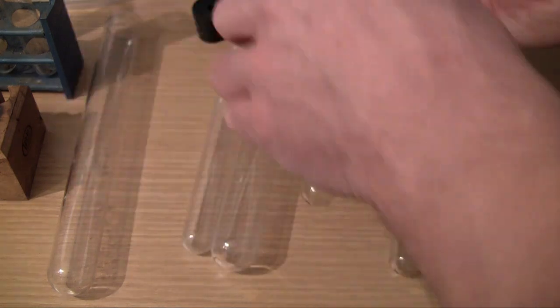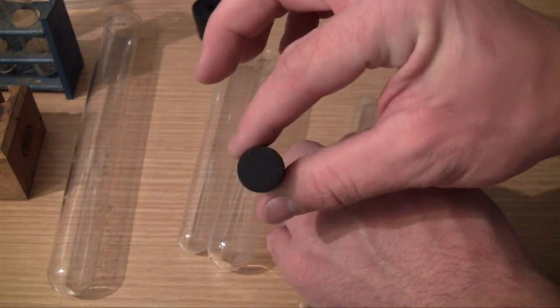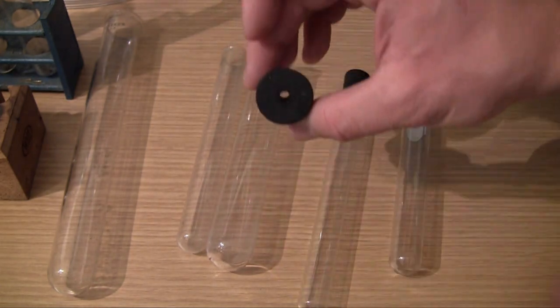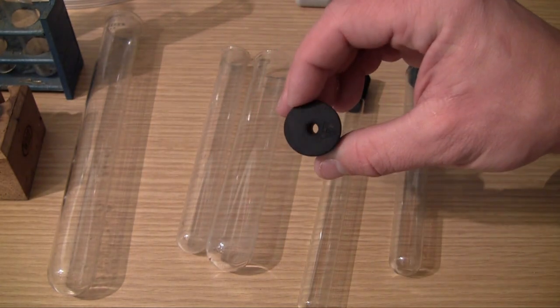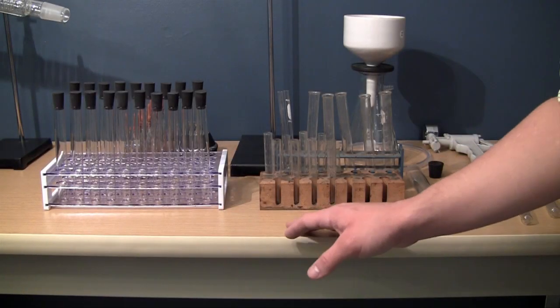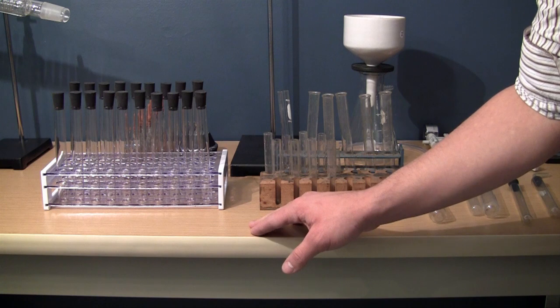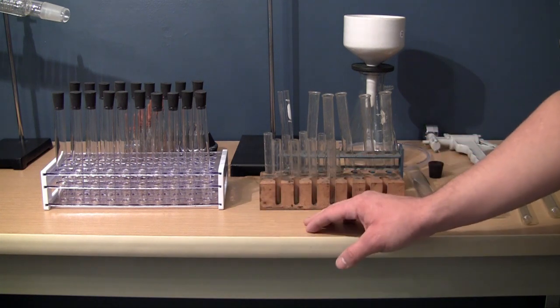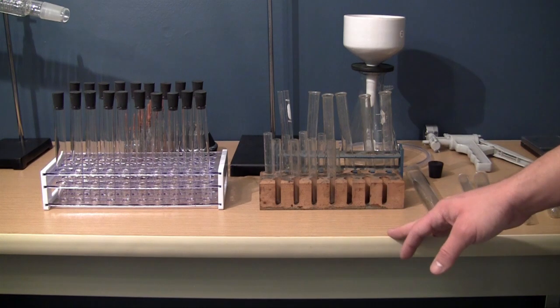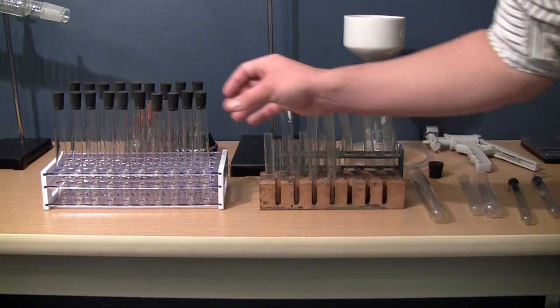So again, remember that whenever you buy test tubes, make sure to get solid rubber stoppers or corks and also rubber stoppers with a hole in them for whenever we want to capture fumes. Now it's best to have a wide variety of test tubes in different sizes, and you also want to have a mixture of plastic and glass test tubes. If you can only choose one, I would probably recommend glass.